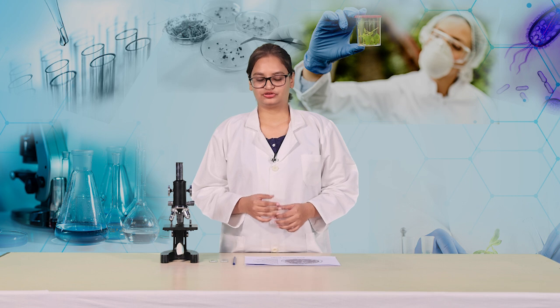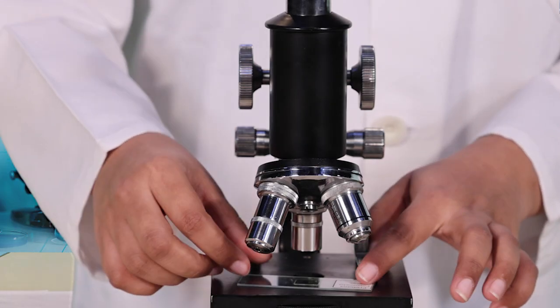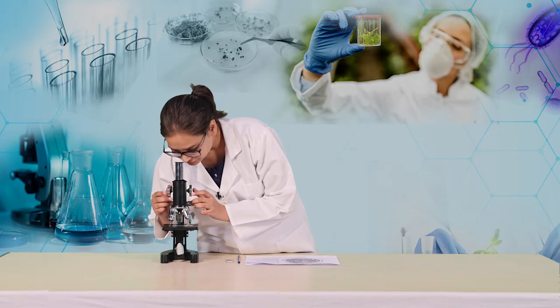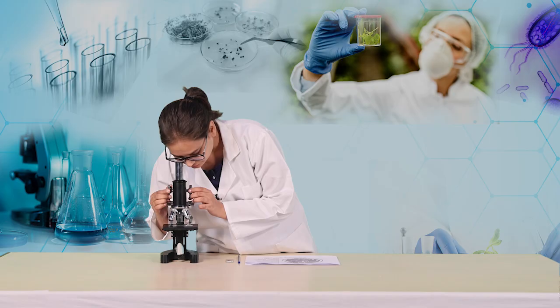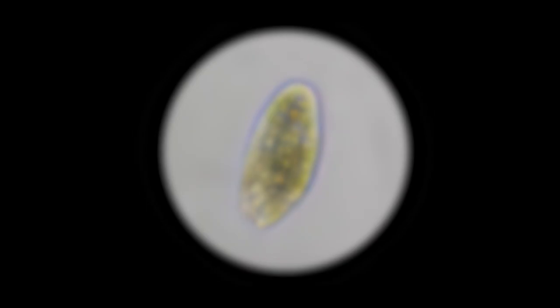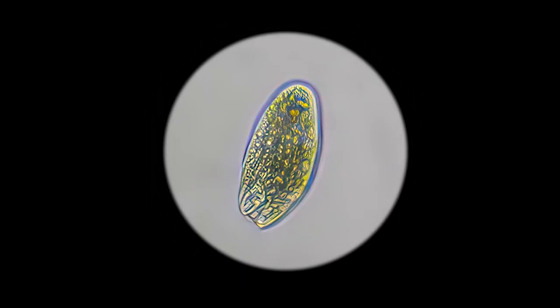Let's take the permanent slide of Entamoeba histolytica and place it under low power of the compound microscope. Let's focus it properly and try to observe the features. We can also observe it under high power of the microscope.